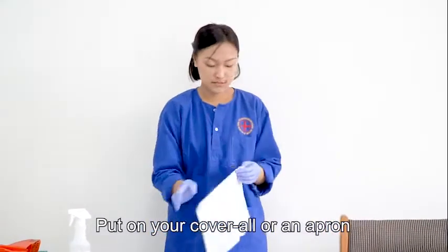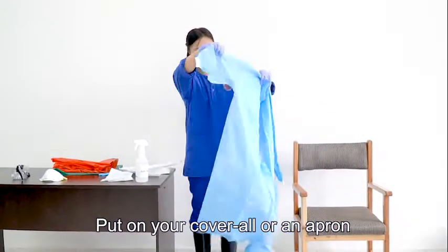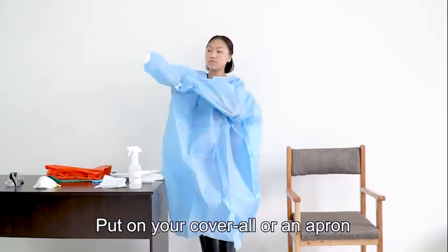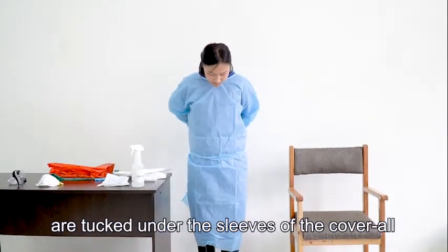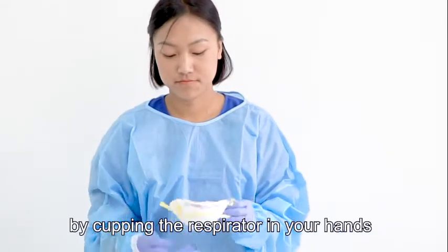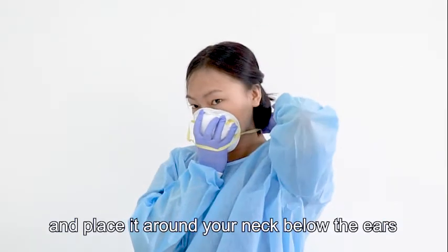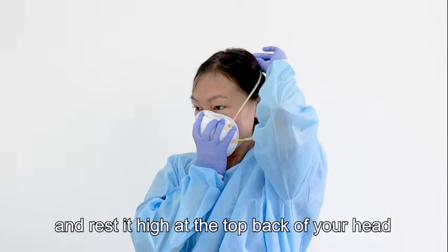Put on your coverall or the apron. Make sure it is large and allow free movement. Ensure the cuffs of inner gloves are tucked under the sleeves of the coverall. Put on N95 respirator by cupping the respirator in your hands with the nose piece at the fingers. Position the respirator under your chin with the nose piece up. Pull the bottom strap over your head and place it around your neck below the ears. Then, pull the top strap over your head and rest it high at the top back of your head.